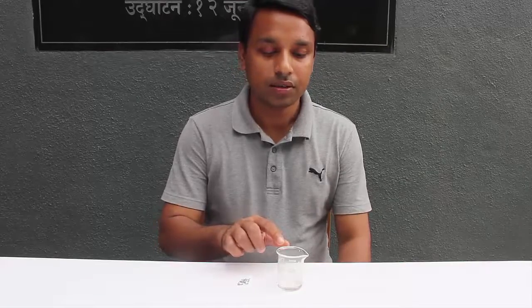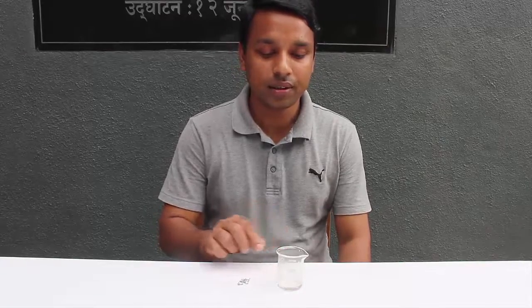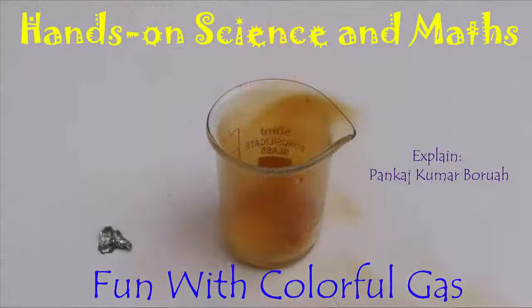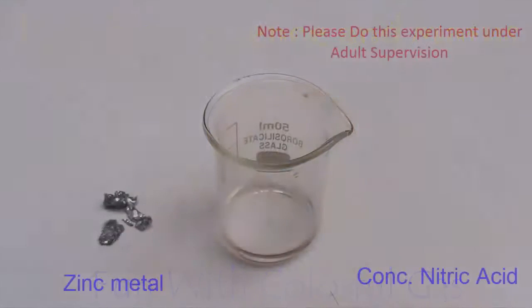For this we will need two chemicals: one is concentrated nitric acid which is in the beaker and a few pieces of zinc metal.